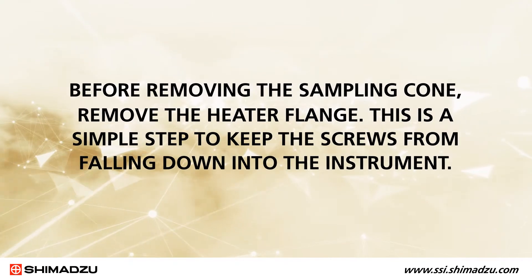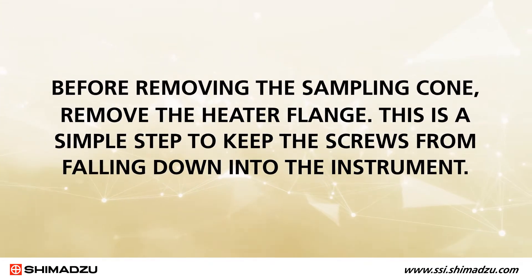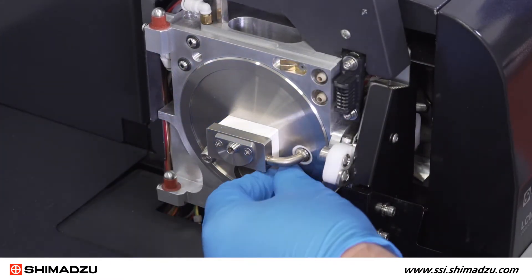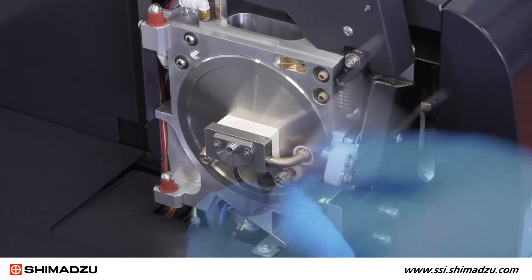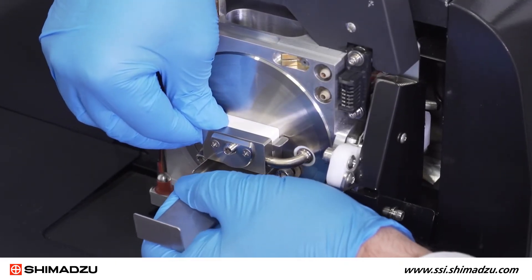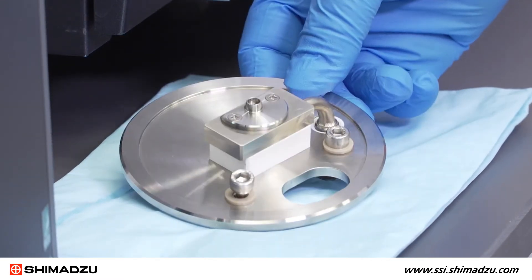Before removing the sampling cone, remove the heater flange. This is a simple step to keep the screws from falling down into the instrument. Using the hex wrench, loosen both bolts on the front of the heater flange. The bolts have a capture mechanism, so you cannot completely remove them from the flange. Using the drawing tool, remove the heater flange by inserting it behind the heat block and pulling the heater flange straight out. Set it aside on a clean surface.